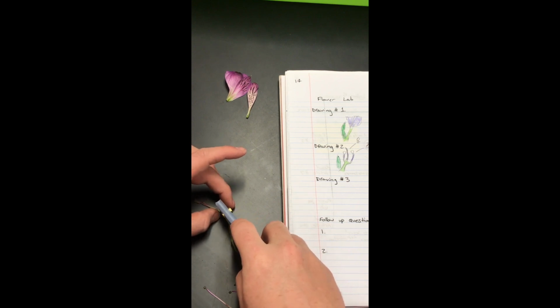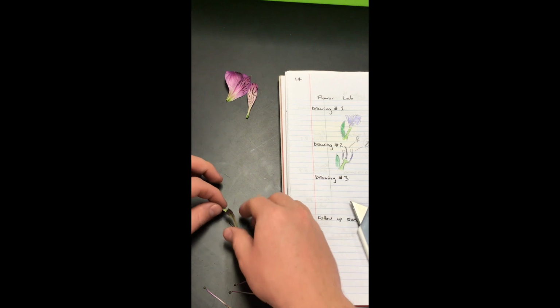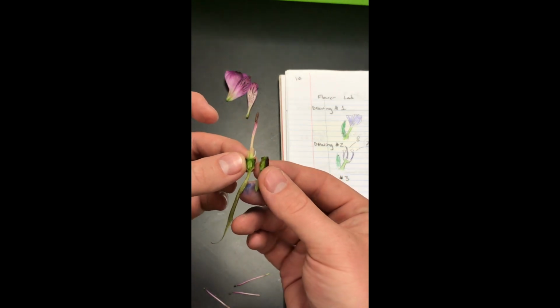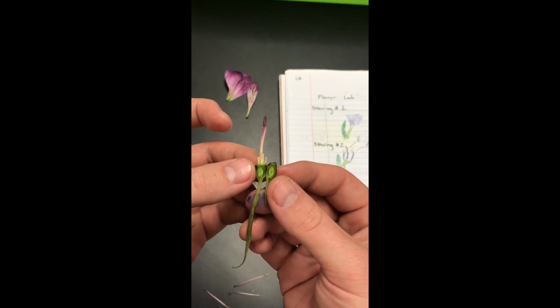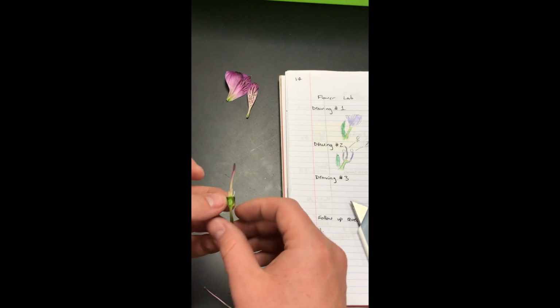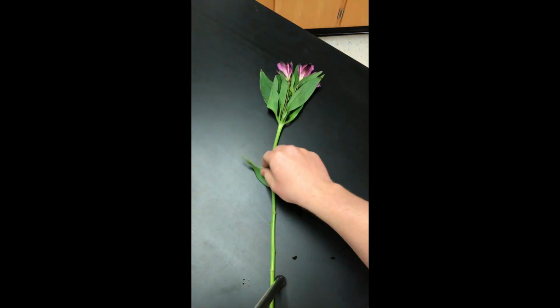In drawing 3, you guys are going to have to use this very sharp X-Acto knife again and cut hot dog style down the carpel and expose that ovary. And if you would like to zoom in there, you can see all of the nice eggs just waiting to be fertilized. And I will go ahead and draw that in my third area.